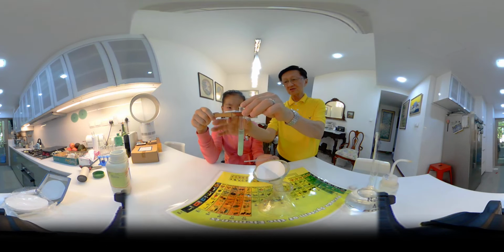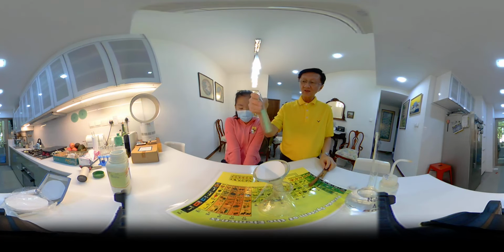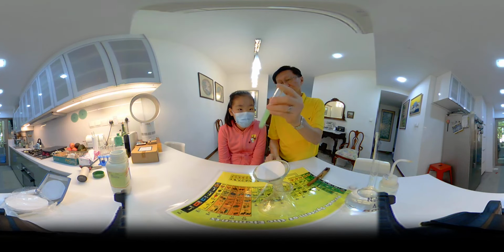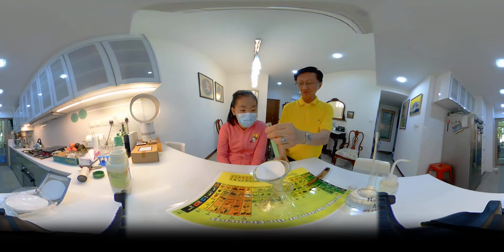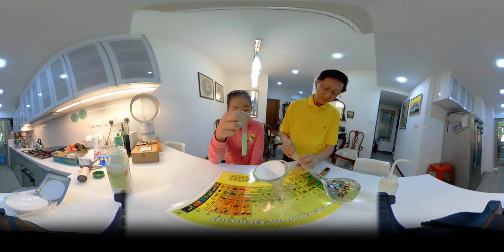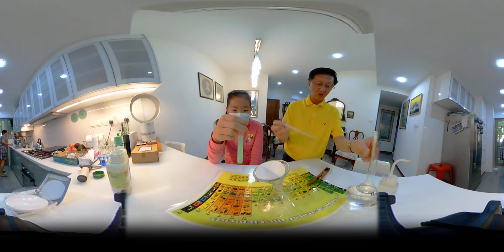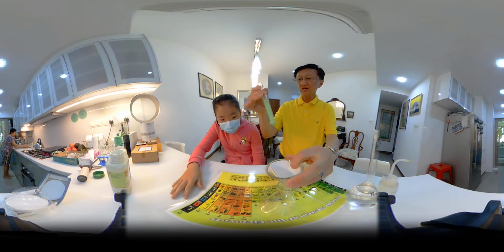This is a little bit hot. Okay. So you can see the nickel 2 hydroxide is coming out, right? Nickel 2 hydroxide. So maybe we'll hold on the top portion. Let me put some more. Okay, I think this should be enough. And let's filter this one out.